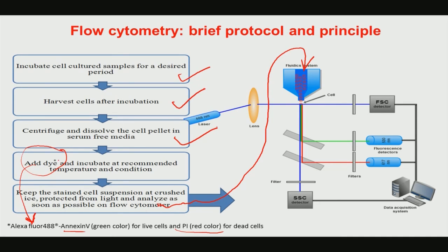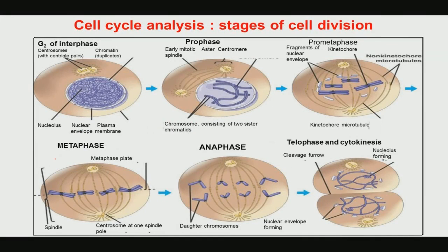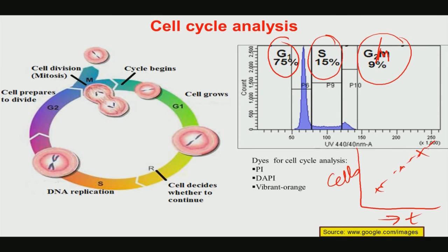Now, whether you want to study typical cell viability or necrosis and apoptosis, you have to use different dyes. If you want to study cell growth processes, cell division, or the cell cycle, then you have to use different dyes. Essentially, each time you have to use different dyes, and there is a scientific rationale which tells you that the progressive reduction of specific dyes will give a signature of certain processes.